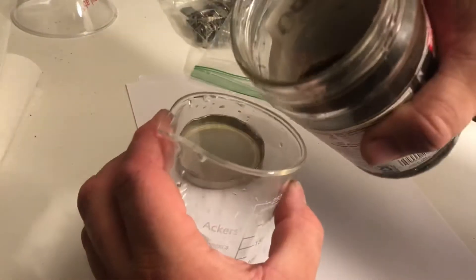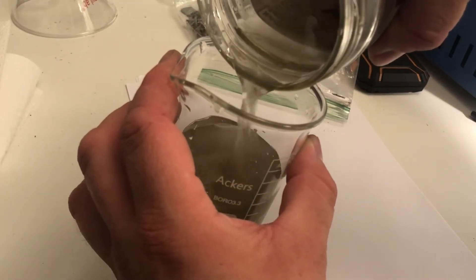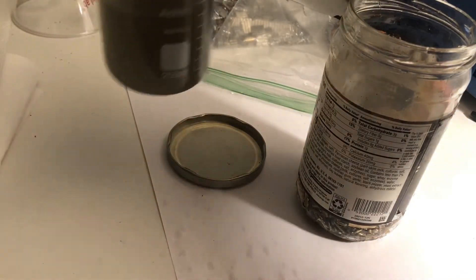After just a few seconds of shaking it, you can see there are huge chunks of gunk coming off. I would wash that out a couple of times.